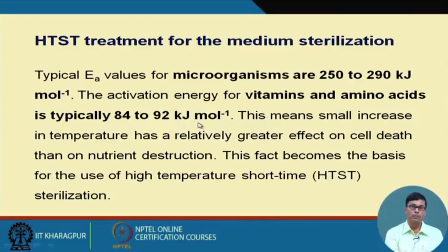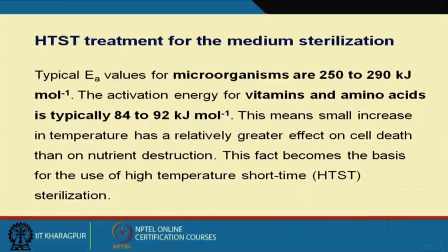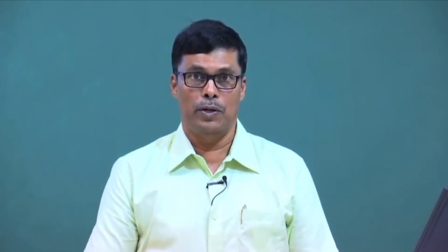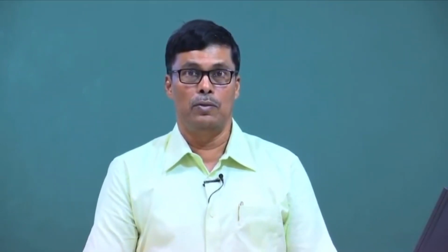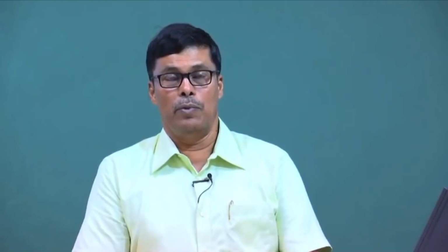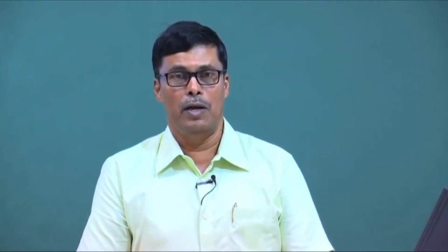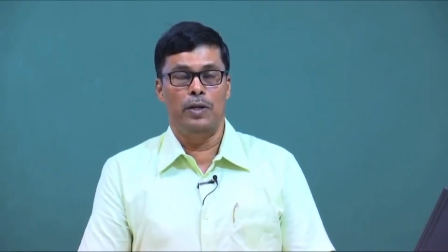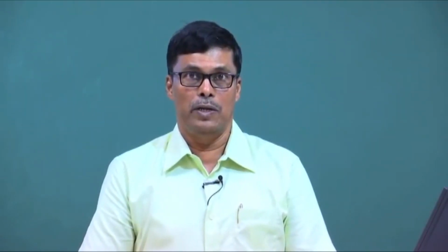That means if you heat the media at a low temperature, it is more effective at destroying the vitamins and amino acids. That is why, in household use, when we purchase some kind of medicinal tonic, it is always prescribed that you keep it at low temperature, because those tonics mostly comprise vitamins and amino acids, and they are very sensitive to temperature. So even at low temperature, denaturation may take place.